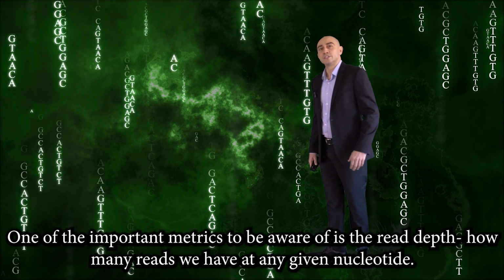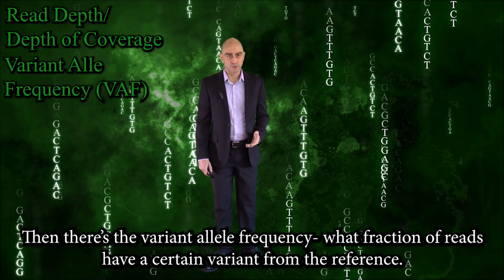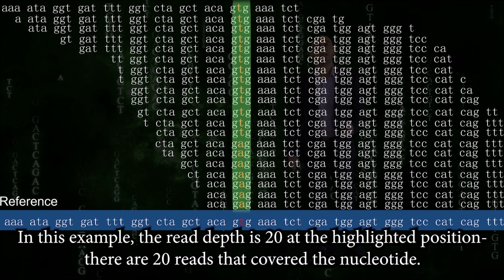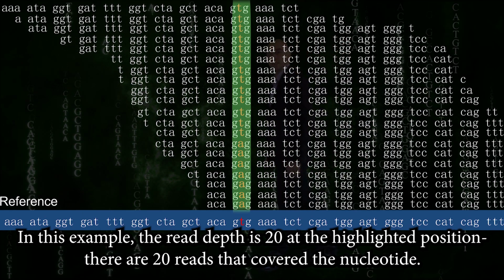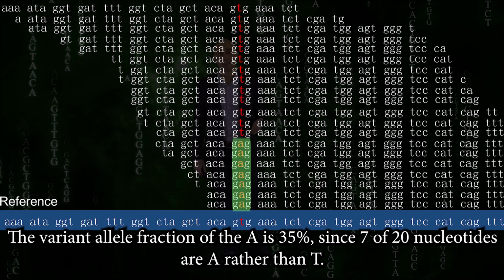One of the important metrics to be aware of is the read depth, how many reads we have at any given nucleotide. Then there's the variant allele frequency, what fraction of reads have a certain variant from the reference. In this example, the read depth is 20 at the highlighted position. There are 20 reads that cover the nucleotide. The variant allele fraction of the A is 35%, since 7 of the 20 nucleotides are A rather than T.